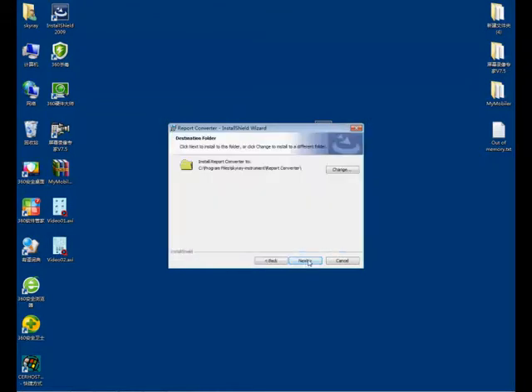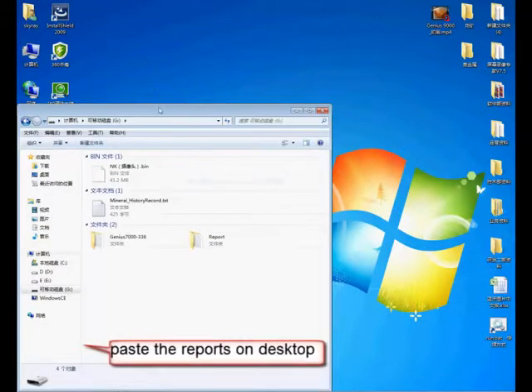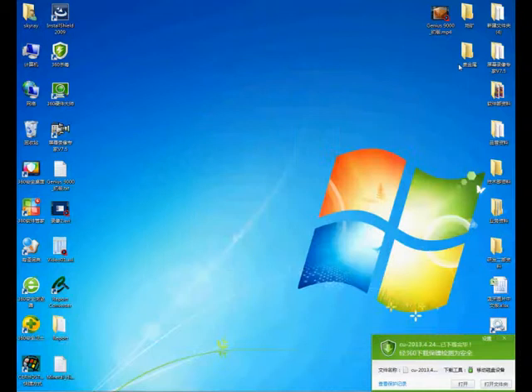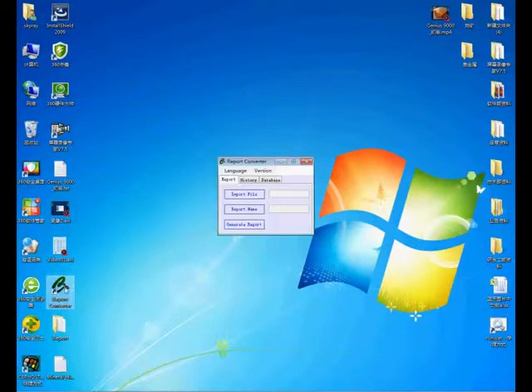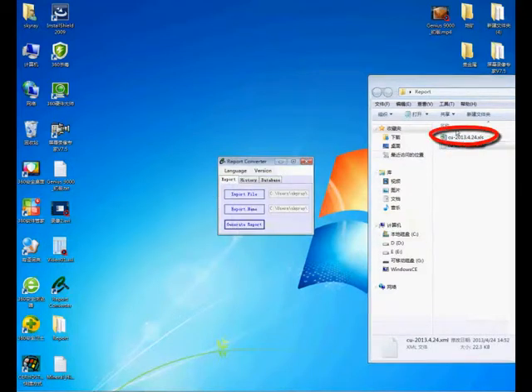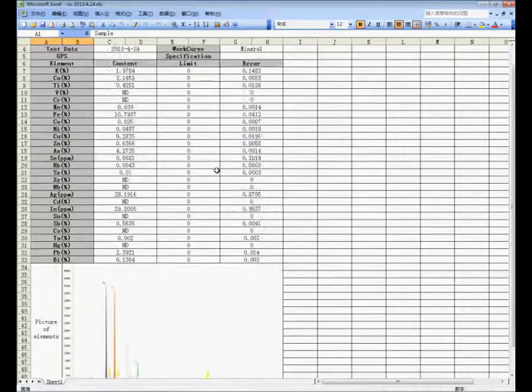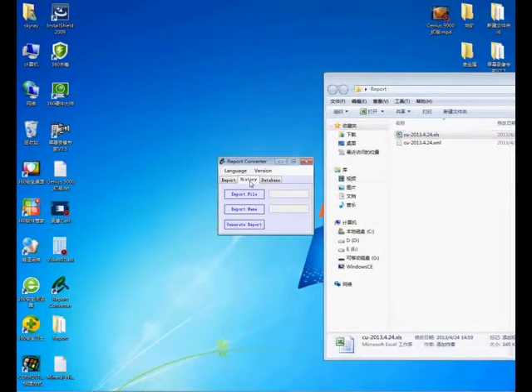Copy the Report and History Report files. Start the Report Converter Software. Drag the XML files into the software and click Generate Report. Click History, drag the History Record file into the software, then click Generate Report.